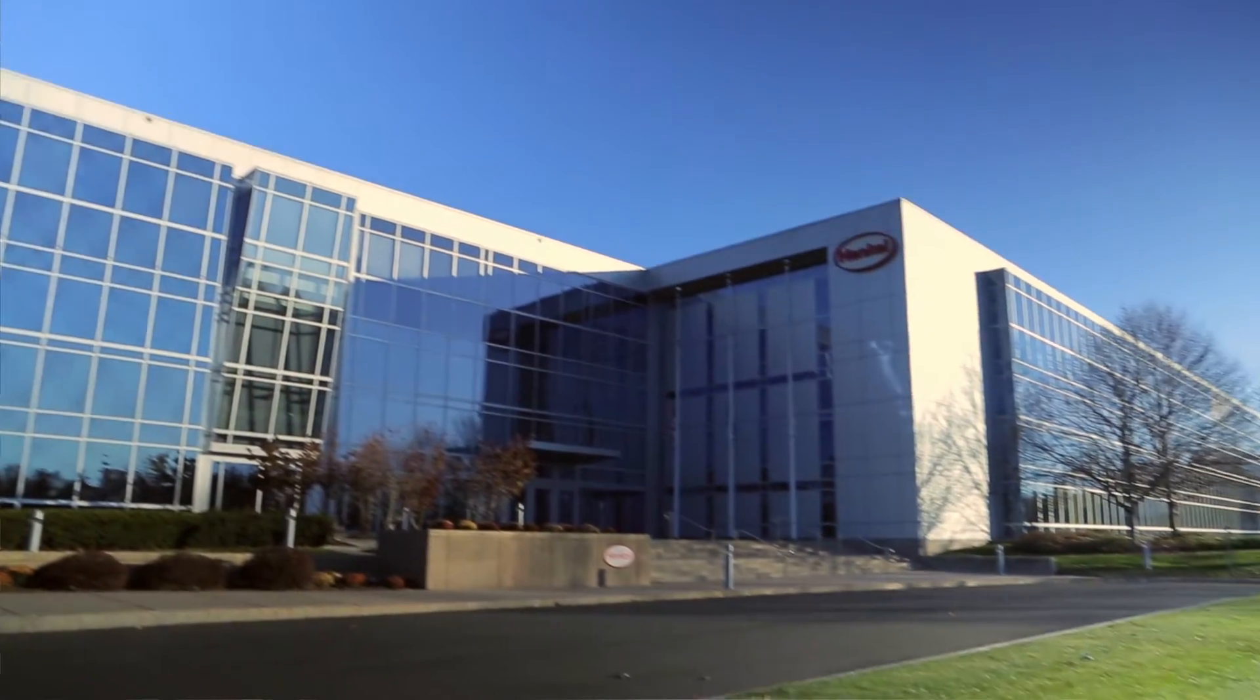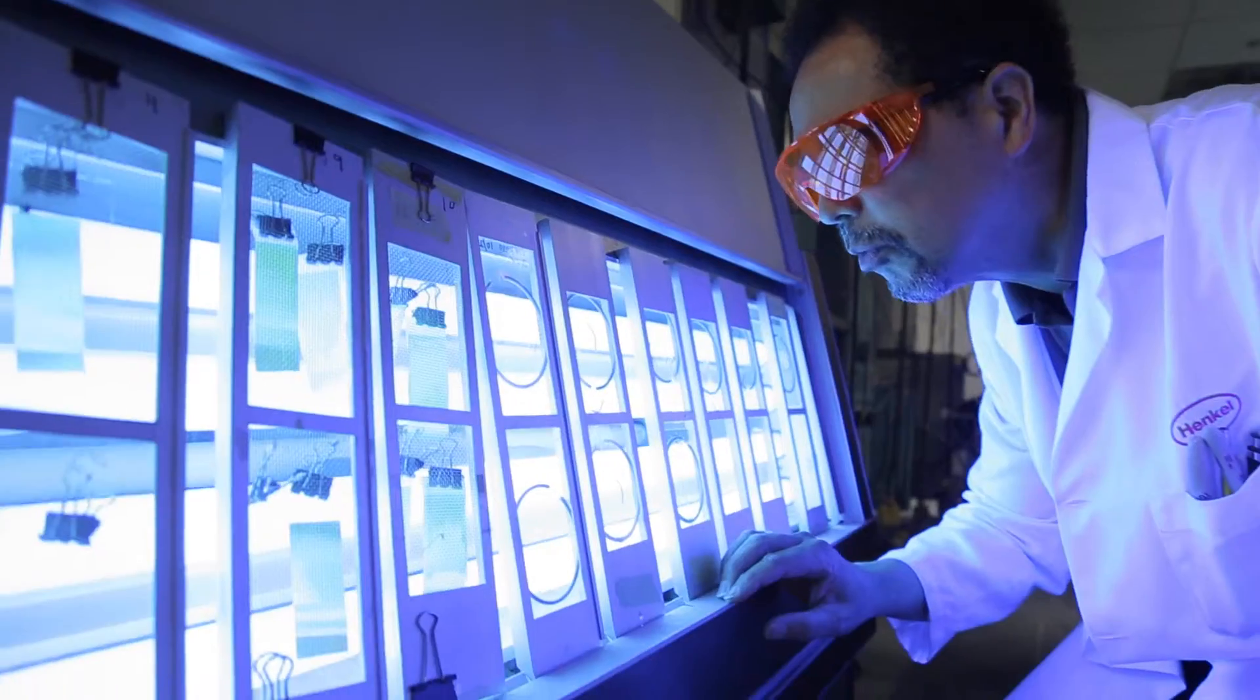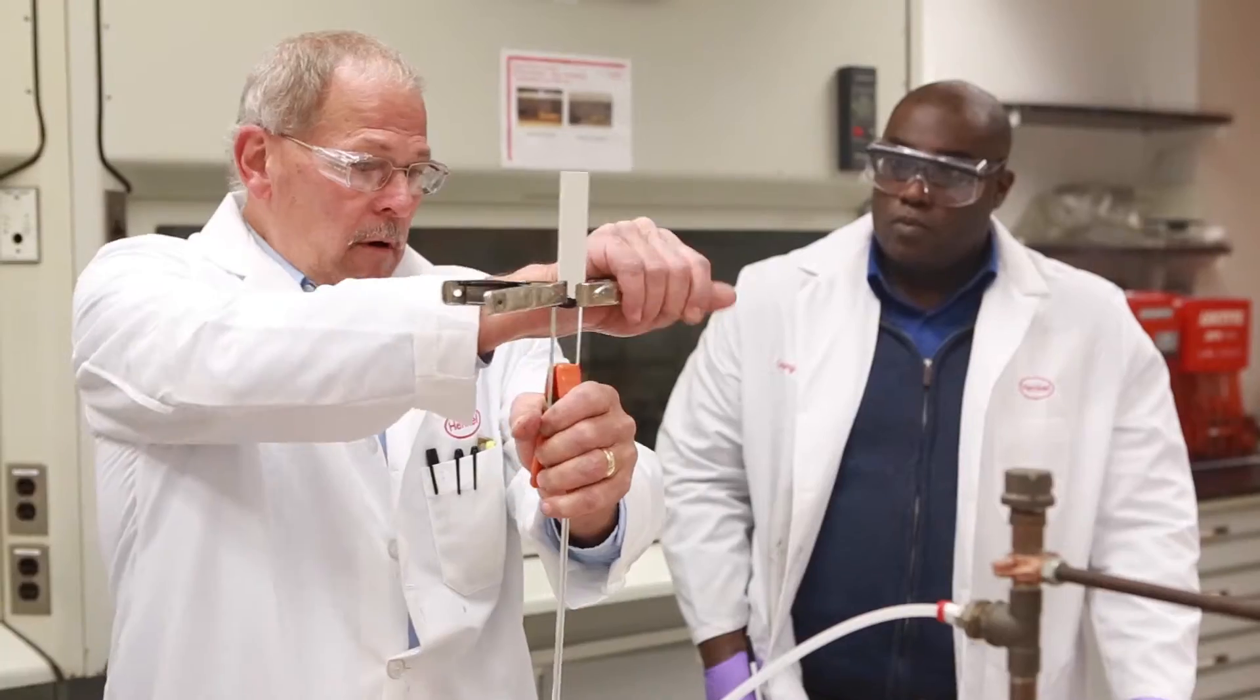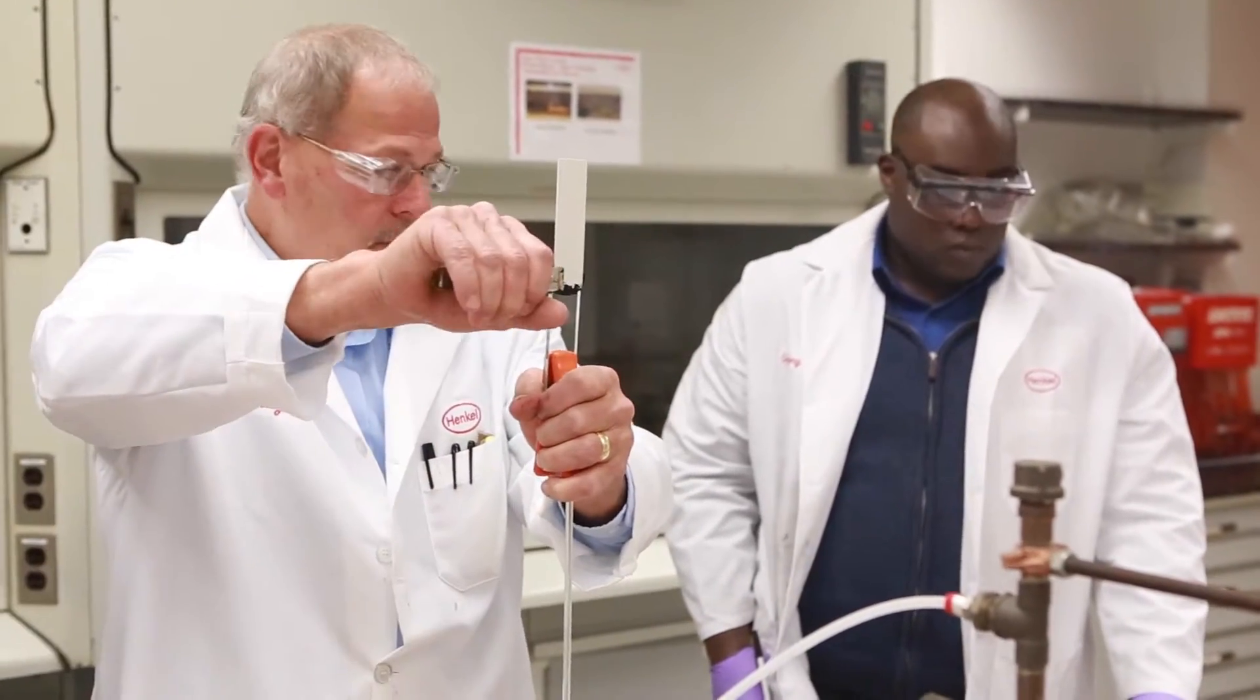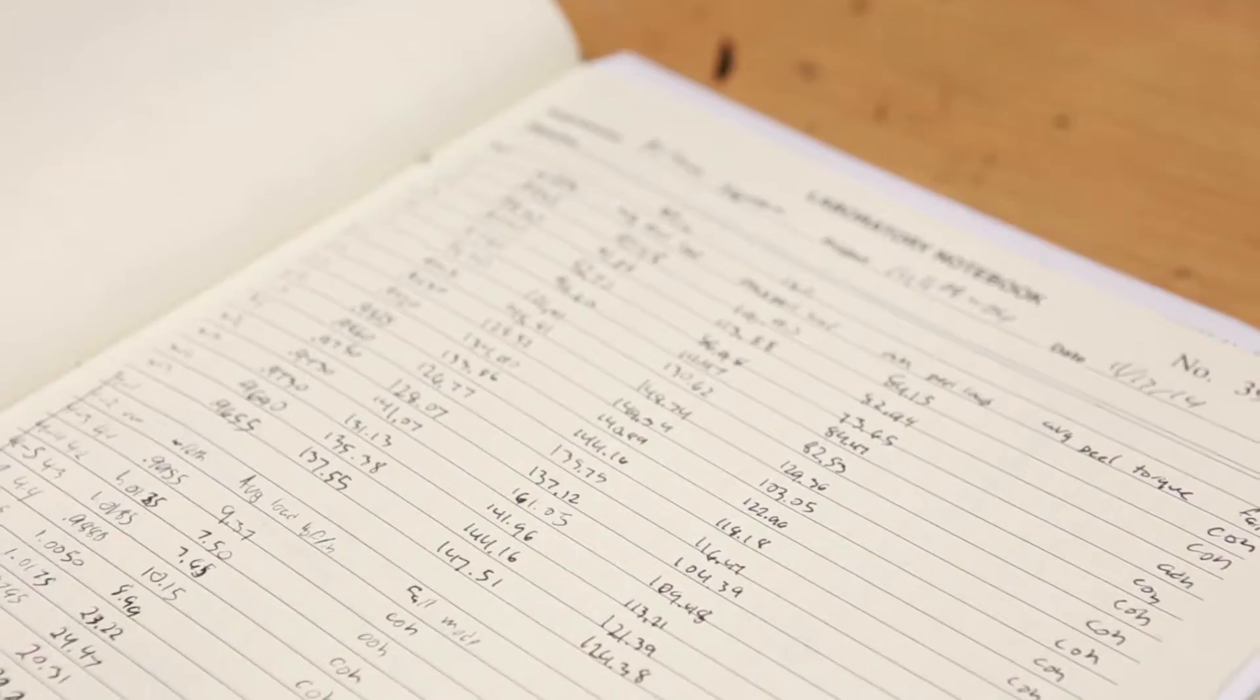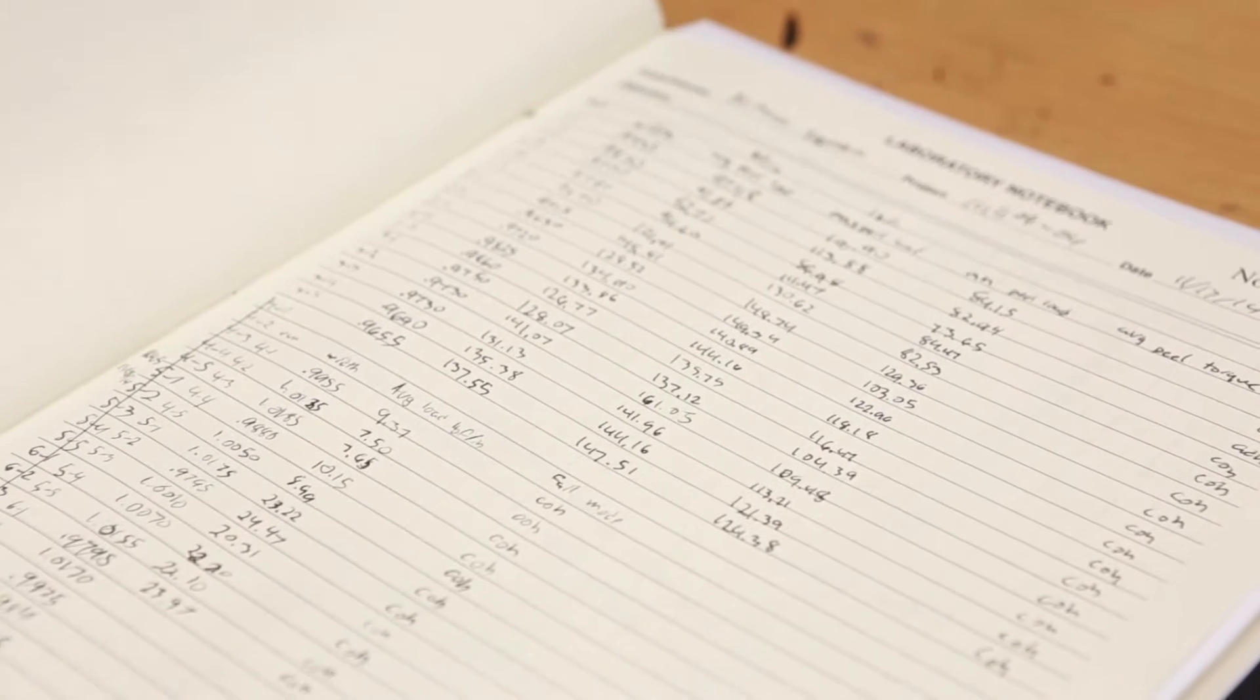Here at Henkel, we run our products through an array of tests that help determine which adhesive solutions are right for our customers, allow for quality control at every step of product design and manufacture, and provide data that describe the material characteristics of our products.